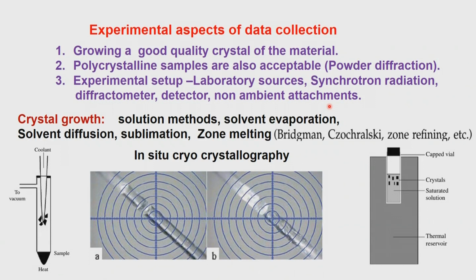You see, the whole idea is to get the reflections in the entire reciprocal lattice frame. That means all possible reflections which come within the limiting sphere must be collected. The larger the data that we get, the better it is, and that is where we decide on the quality of the crystal. The quality of the crystal is not judged by the looks of the crystal, but by the extent to which it diffracts. As we discussed earlier about the resolution limits, we calculated the value of d from 2d sin theta = lambda, and the value of d decides what resolution of data we can expect, by checking the extent to which the diffraction occurs in sin theta. So, the larger the sin theta, up to 1.0, the better the data quality, and also the quantity of data. Both are required in order to do a good structure determination protocol.